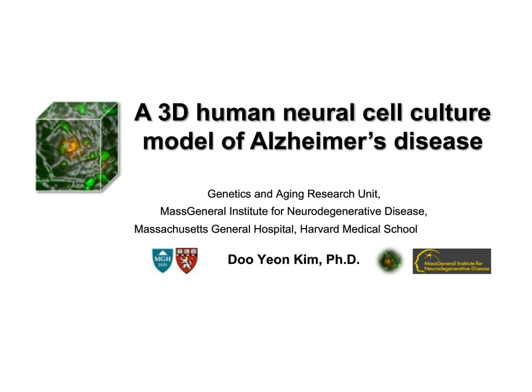Next, I will explain why and how we switched from conventional 2D culture models into the 3D system to recapitulate robust beta amyloid and tau pathology. At the end of this talk, I'll also discuss the challenges and prospects of 3D culture system in modeling Alzheimer's disease and possibly other neurodegenerative diseases.